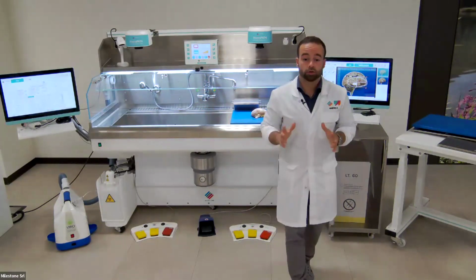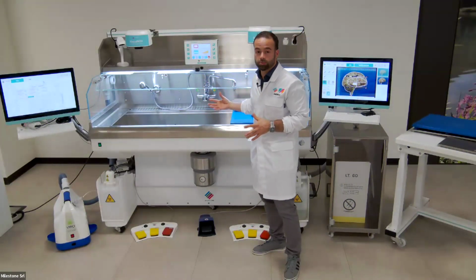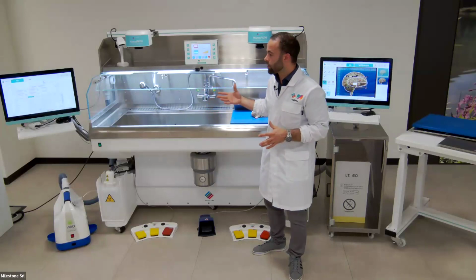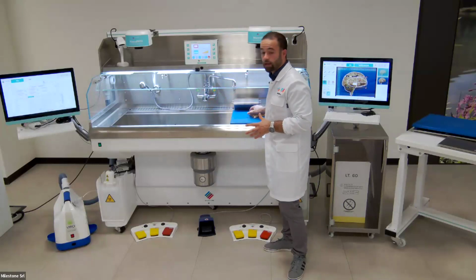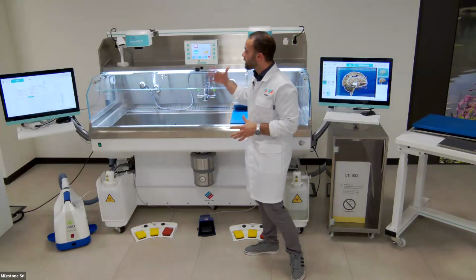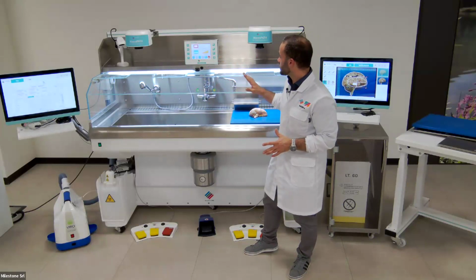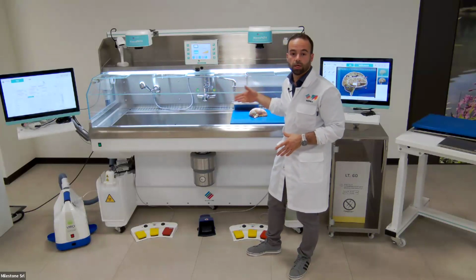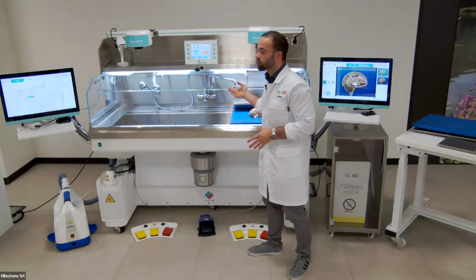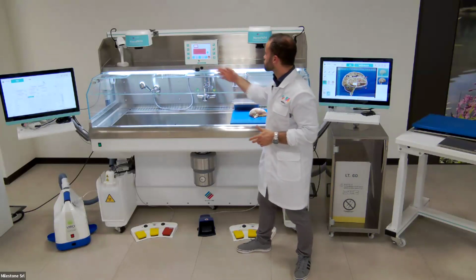So you have to keep in mind that the operator could be exposed to the fumes coming from the sample. So that's why we put an alarm. Anyway, coming back to your question, yeah, the glass shield is movable back and forth, and then you get the notification, as you can hear.